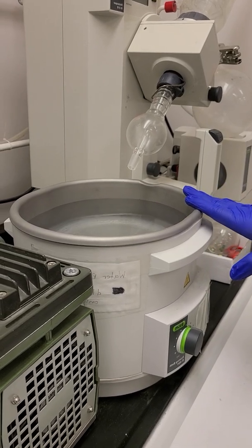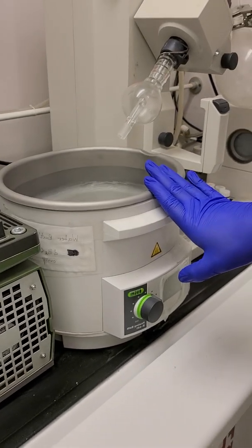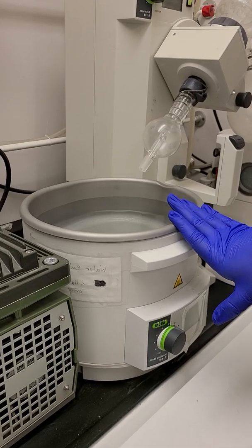It can be filled a little higher. What's going to happen is when you put the heat on, it'll evaporate. So you want to make sure that it's filled high enough and that you keep checking it as the reaction or the evaporation continues.